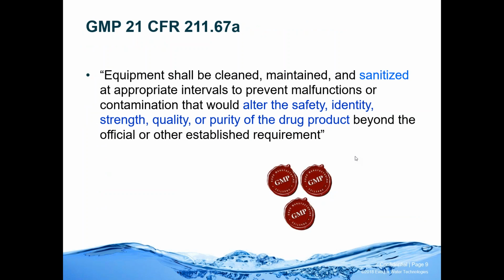Here, in the GMPs, 21 CFR 211.67(a), equipment shall be cleaned, maintained, and sanitized at appropriate intervals, and then basically, simplistically, the rest of that is to prevent a failure of the drug product. So here, sanitized is mentioned, again, a perfect definition not provided, but people understand it means keeping the water system in control to consistently meet the requirements.